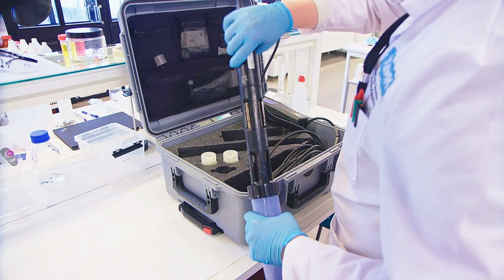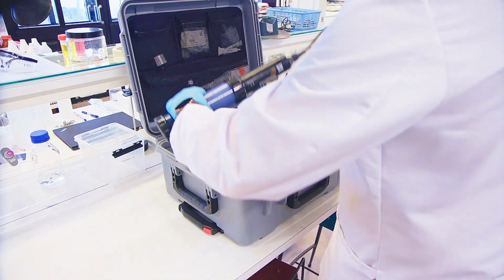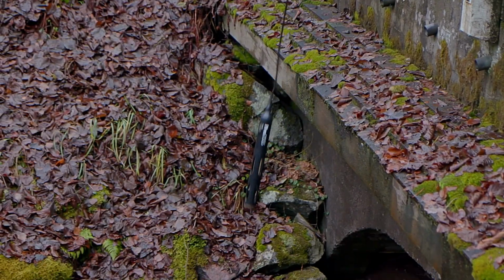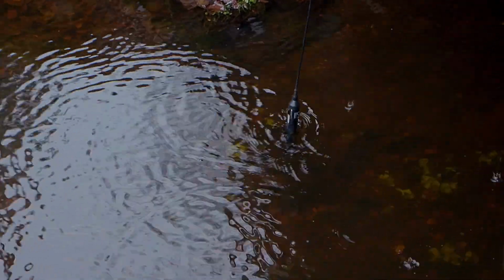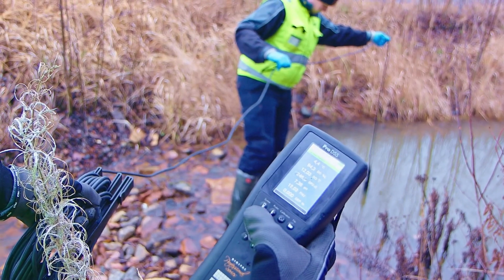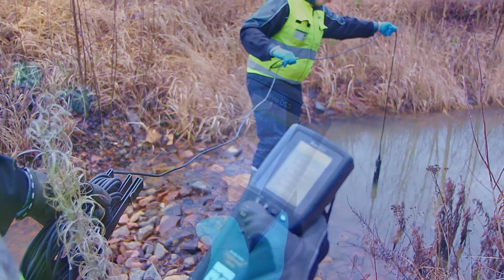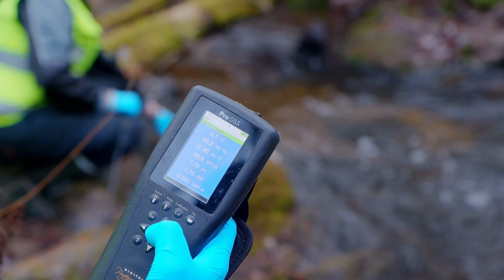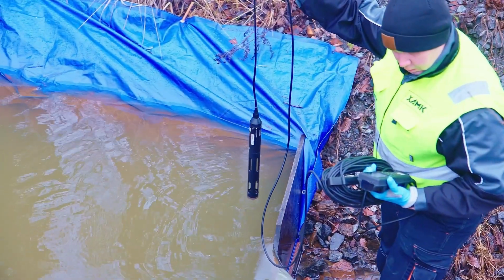The sensors should first be allowed to stabilize in the water to be measured to improve the quality of the measurements. Although measurements can be taken quickly and easily, the measured data are only general water quality parameters for monitoring water quality. This means that you cannot directly identify, for example, contaminants or their concentrations based on the results. However, the measured parameters can provide correlations with other parameters. For example, the amount of phosphorus can be estimated based on the turbidity measured by a meter.